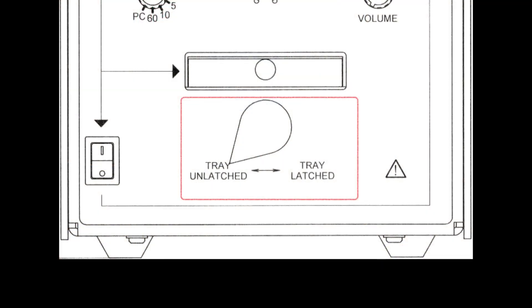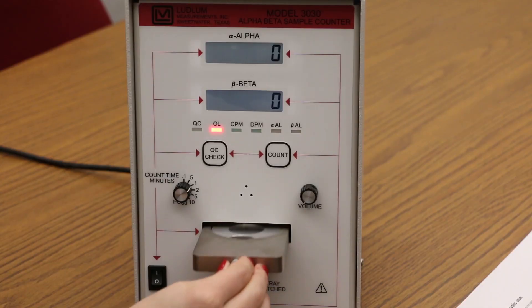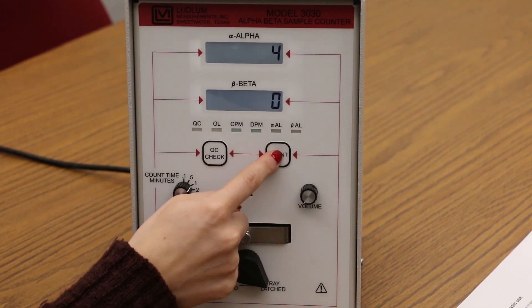A tray switch which is a rotary control used to latch the sample tray. It also lifts the sample tray into position and blocks all extraneous light from the detector. The tray switch should always be in the latched position while counting.